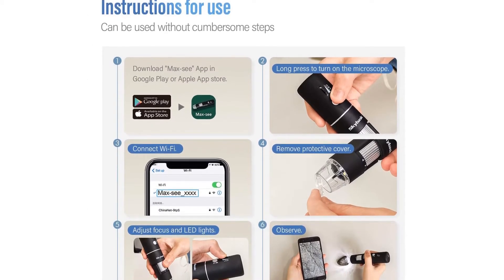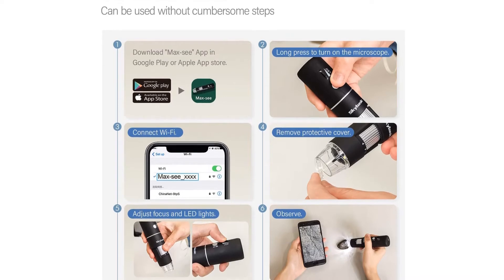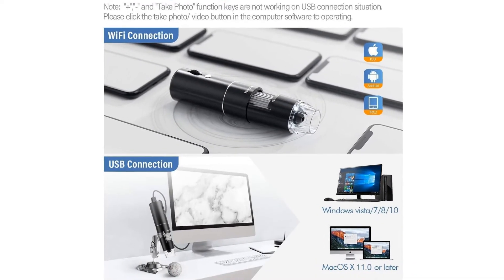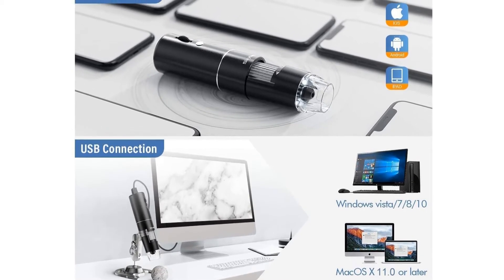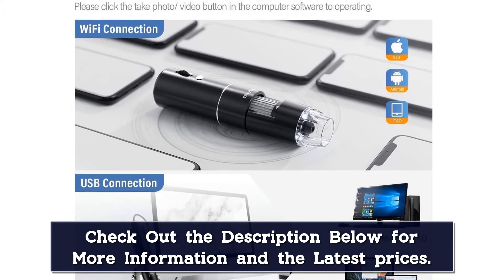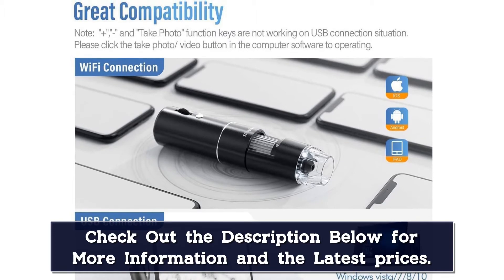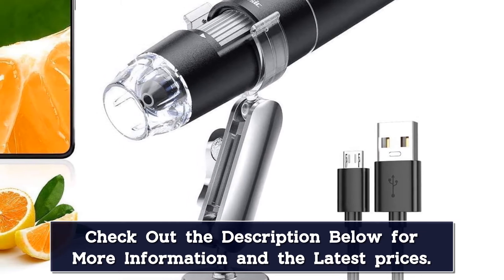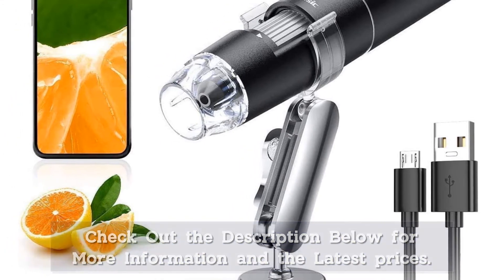Wi-Fi connection for Android and iOS: 1. Download the software Max-see from Google Play or App Store. 2. Long press the power button to turn on the microscope. 3. Connect the Wi-Fi Max-see (no password) which emits from the microscope. 4. Run the app — it is easy to use. For USB connection on PC: For Win 7/8, please download AMCAP to start using. For Win 10, plug into the USB port and search camera in Windows to find it. For MacBook, please use Photo Booth or QuickTime Player directly. Note: please disable the default laptop camera in Windows and change your privacy settings to permit camera access.